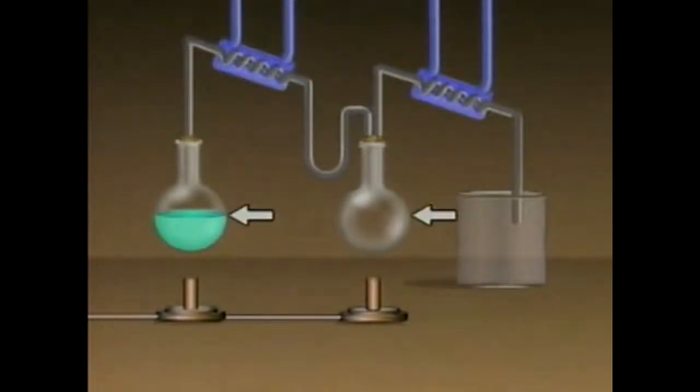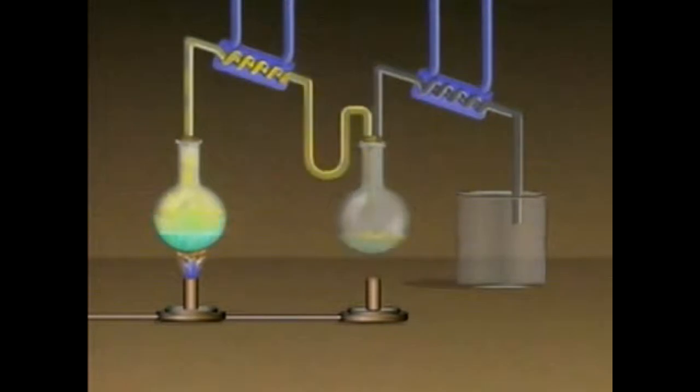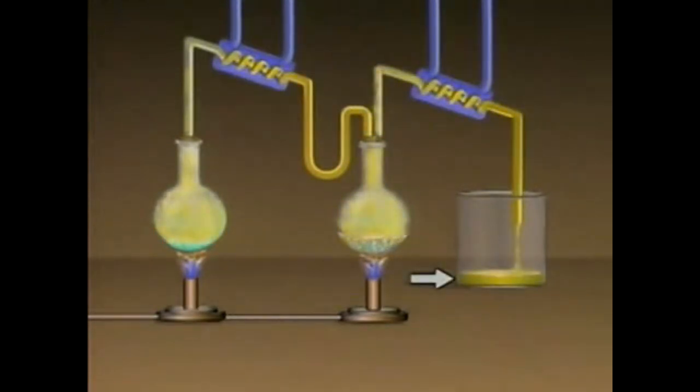This system has two stills, two condensers, and one receiver. The condensed vapors from the first still flow into the second still. The liquid in the second still is then heated until it boils. The overhead product from the second still contains more of the lighter component and less of the heavier component than the original overhead product did. By repeating the process, successive batch distillation produces a purer overhead product than single batch distillation. If a third still were added, an even purer overhead product could be produced.